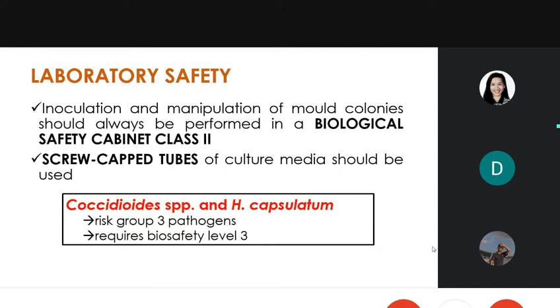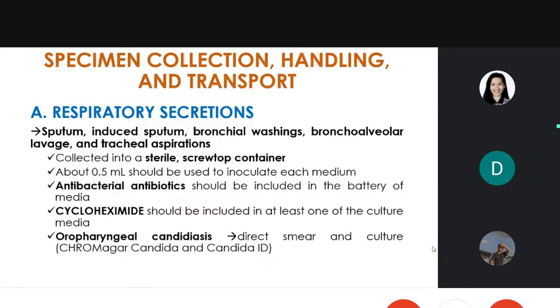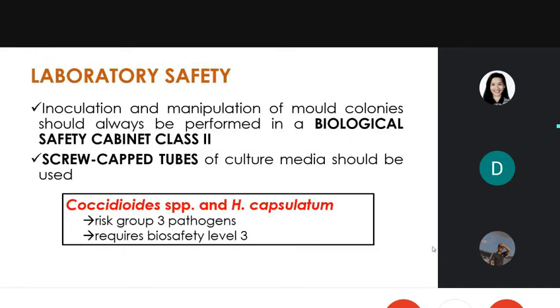Although, the biosafety level, again, here requires already to the laboratory. Ang mga biosafety levels kasi mga academic laboratories, okay na ang biosafety level 1. Okay? So, yung mga biosafety level 3, yan na ngayon yung current na ginagamit para sa ating COVID-19 virus. Okay? So, that is to laboratory safety.